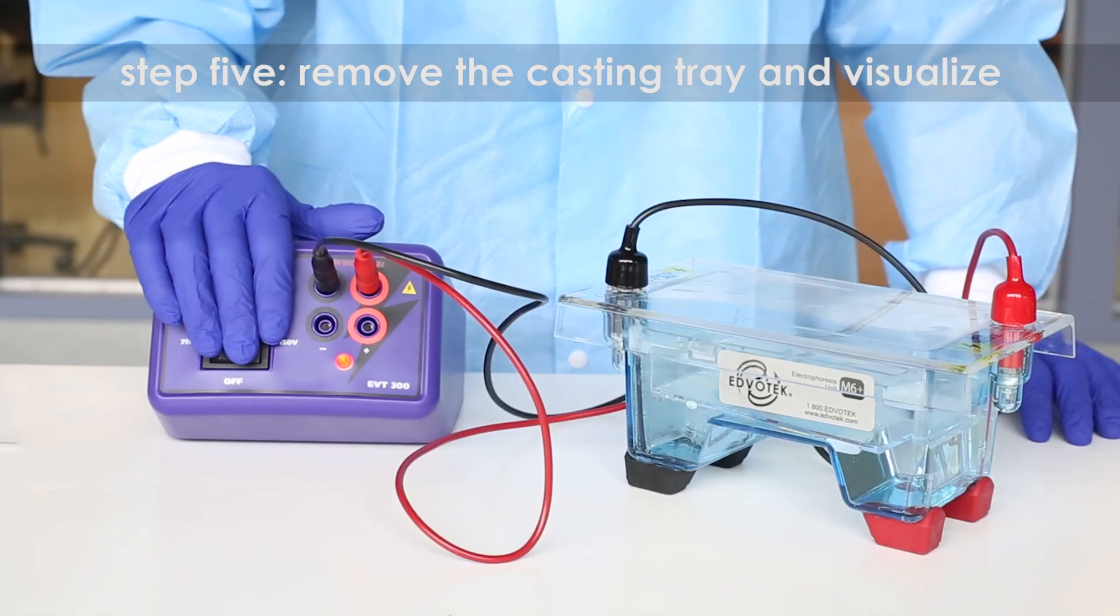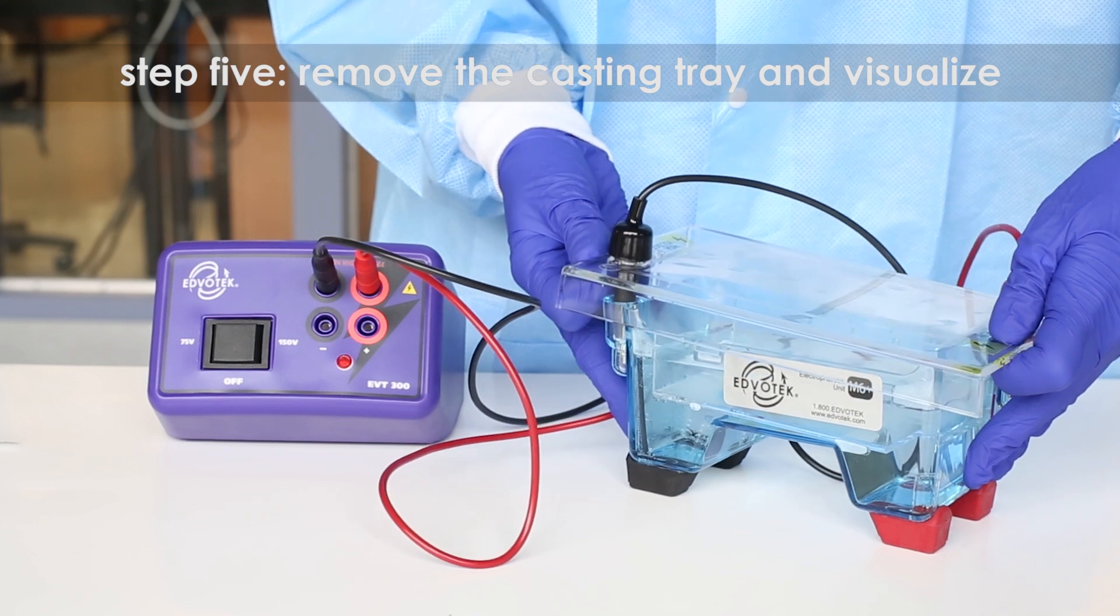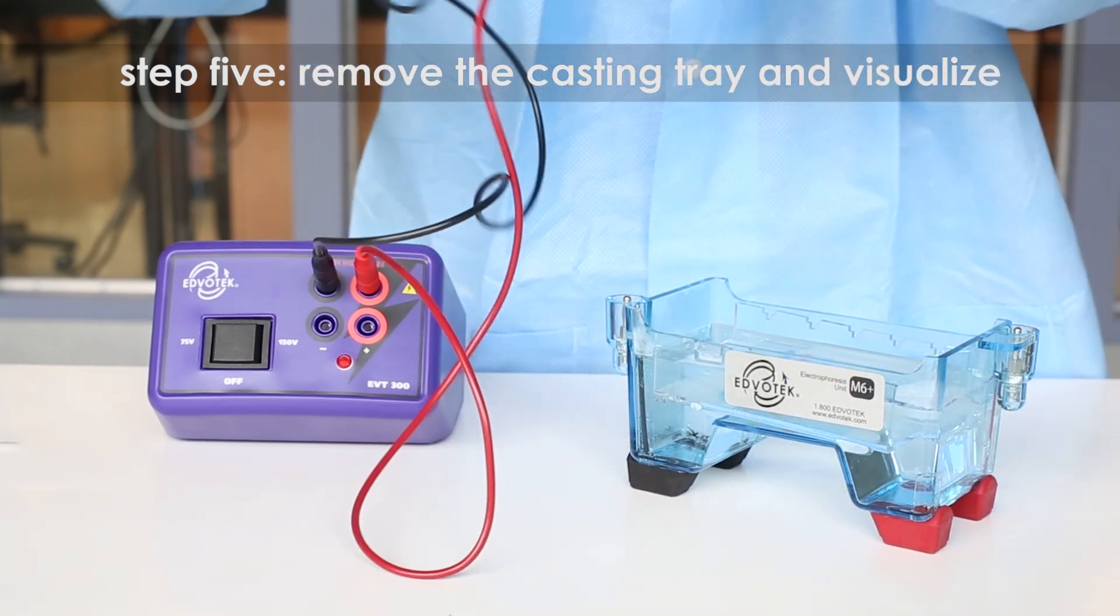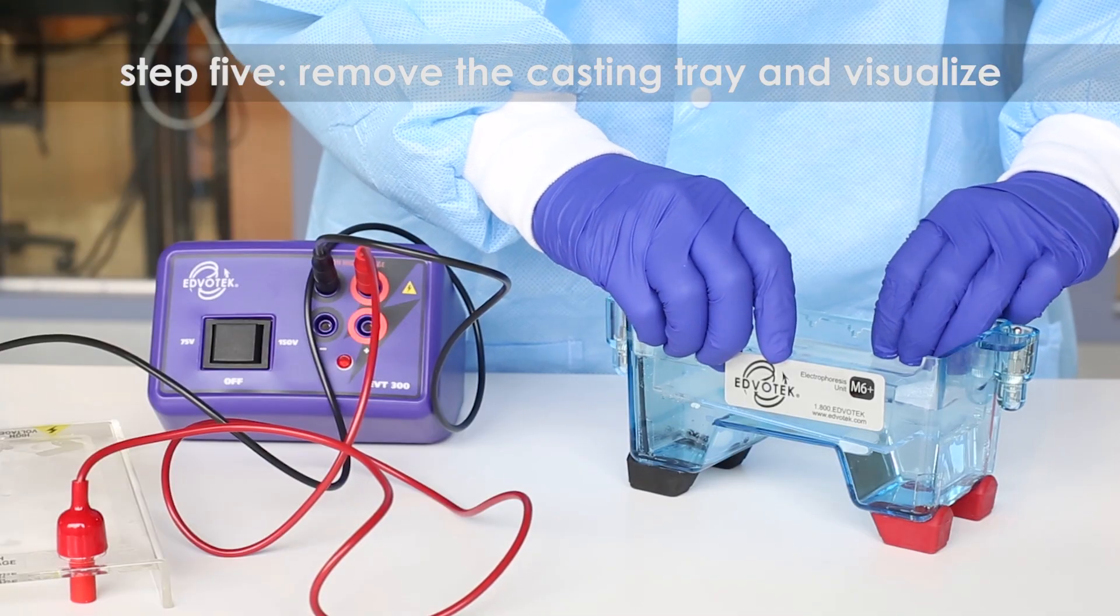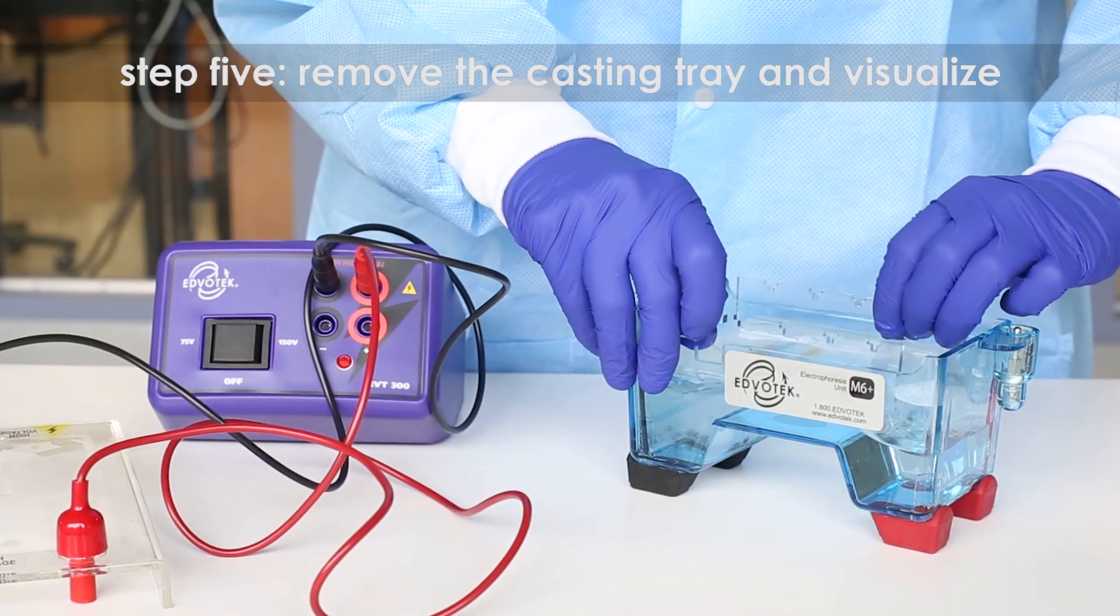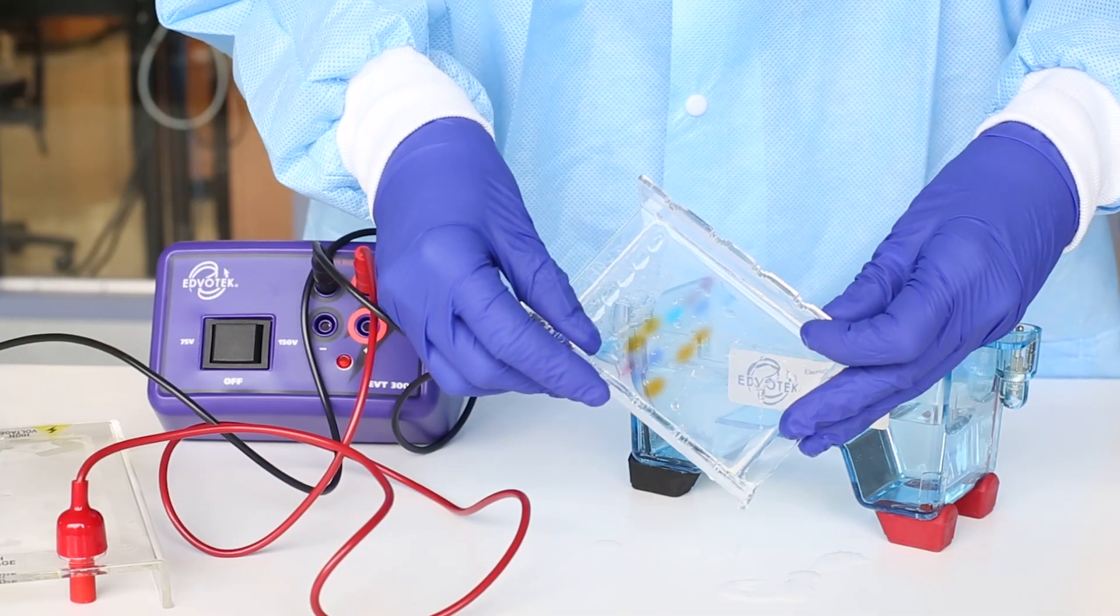Step five: after electrophoresis is complete, remove the gel and casting tray from the electrophoresis chamber and visualize the results. No staining is necessary. And here you see the results.